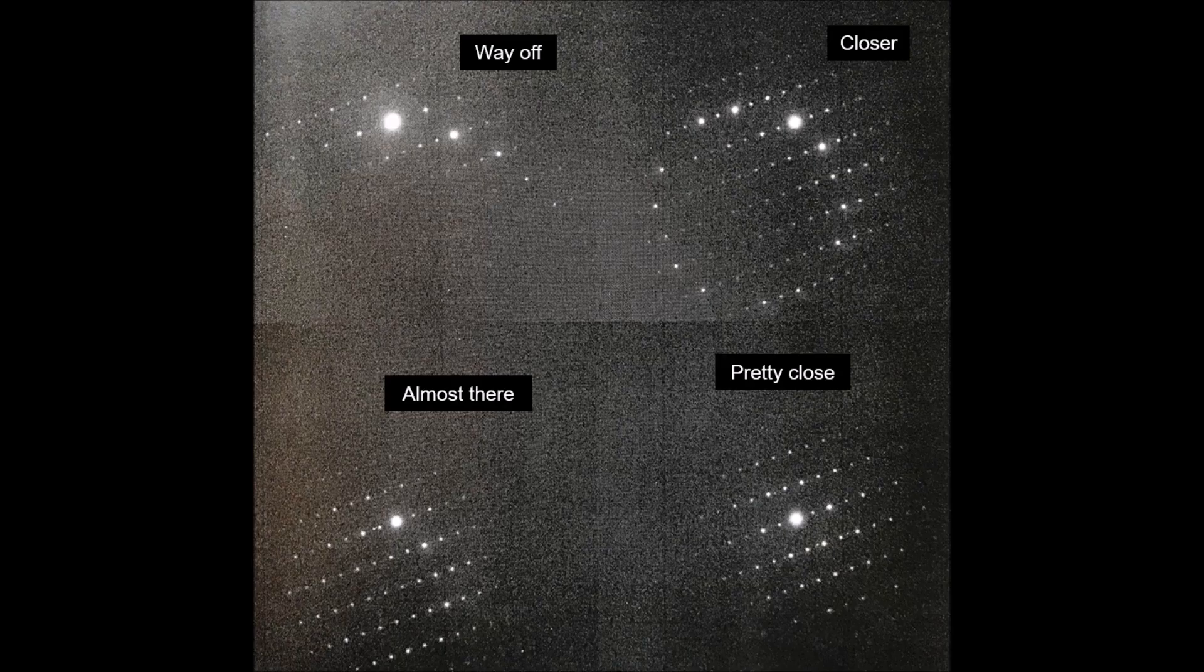So here is a really good example of this that I found in a textbook that shows the progression of being really far off of the zone axis to closing in on it. If we start in the upper left, we see the direct spot.